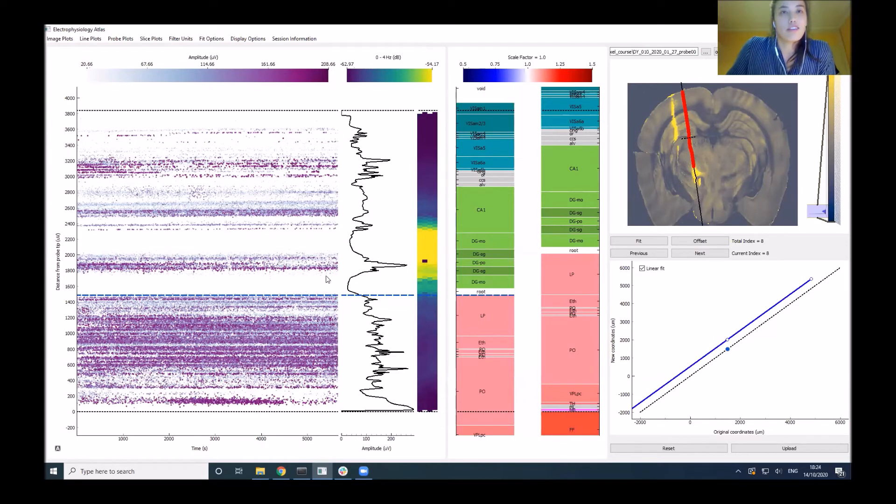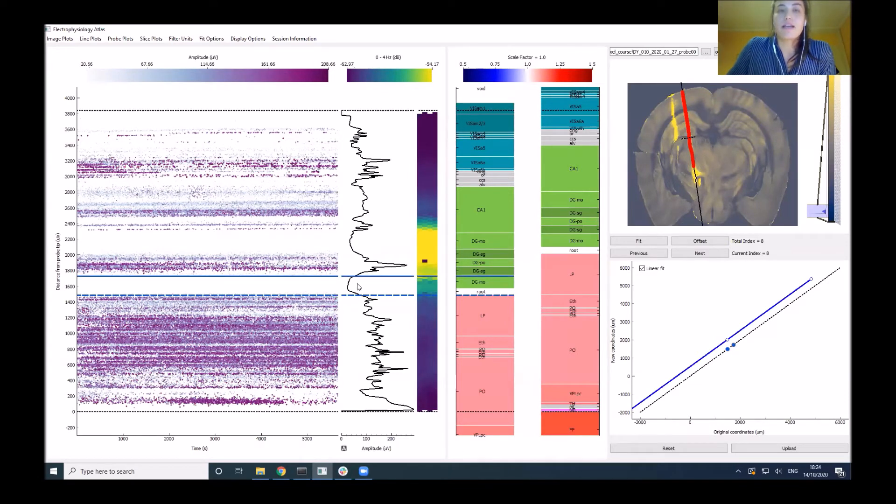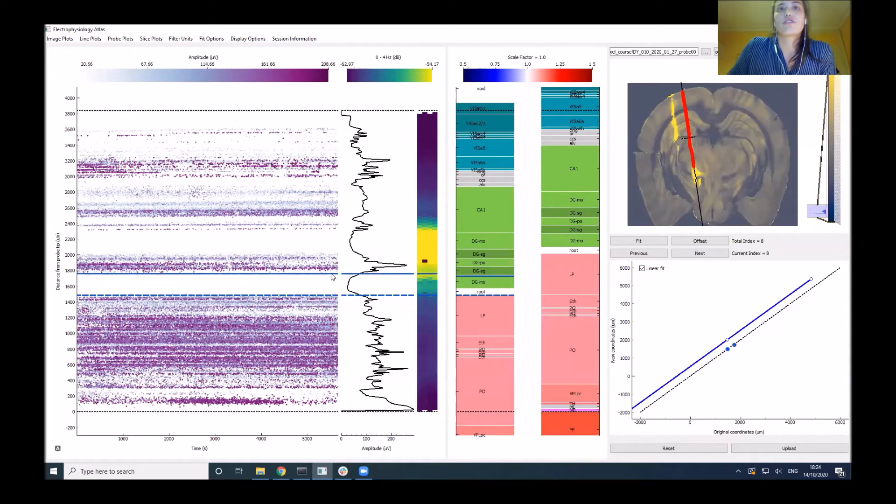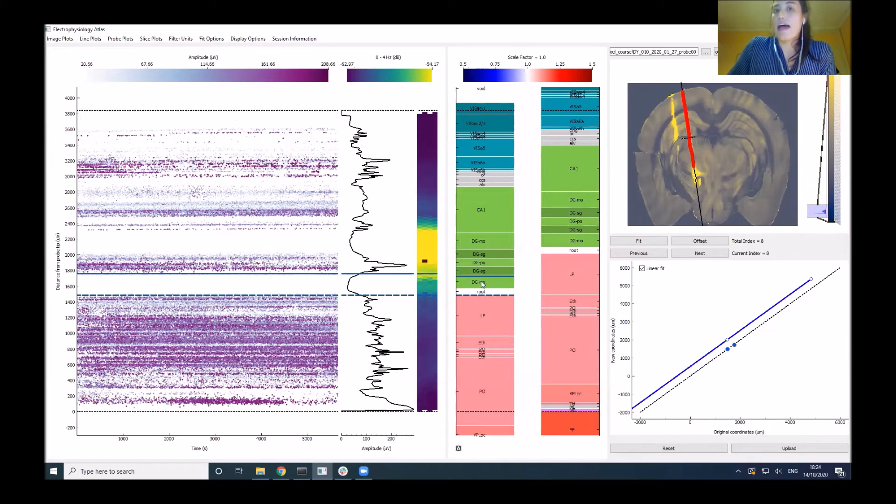The second thing I'd probably do is use the dentate gyrus, as I was explaining before, and assign this to the top of the molecular layer in the bottom. So incorporate this area of air and also the dentate gyrus molecular layer.